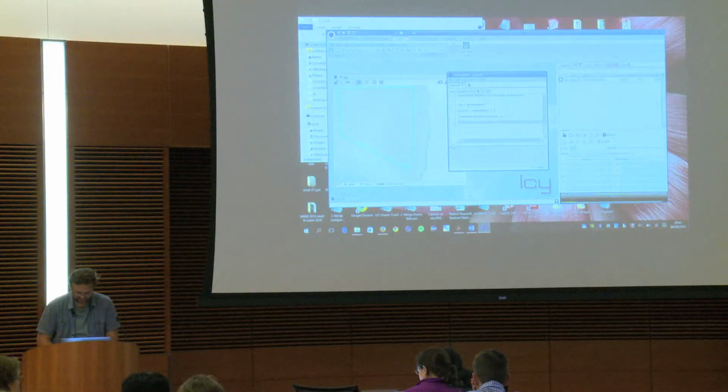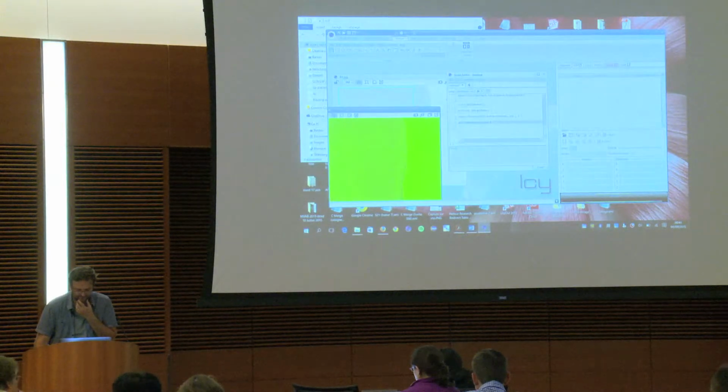And now this is going to be my sequence 2, and I want to display this sequence 2. Add sequence 2, and then I press play. And it works. See?